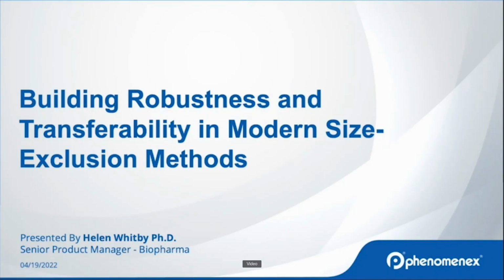Today's presentation will include some discussions around analytes, column materials and chemistry, and practical method considerations when looking at aggregate analysis using size exclusion.